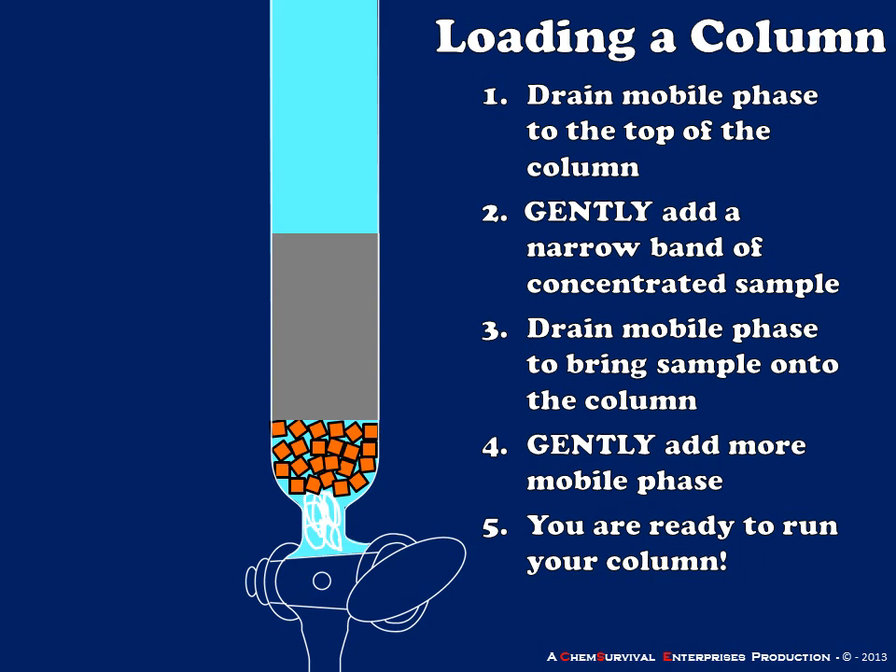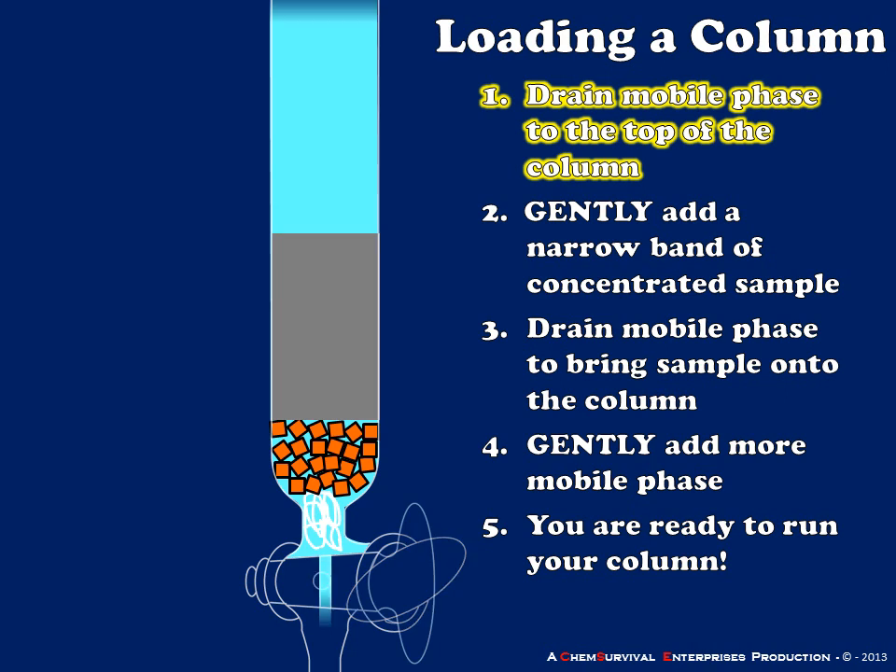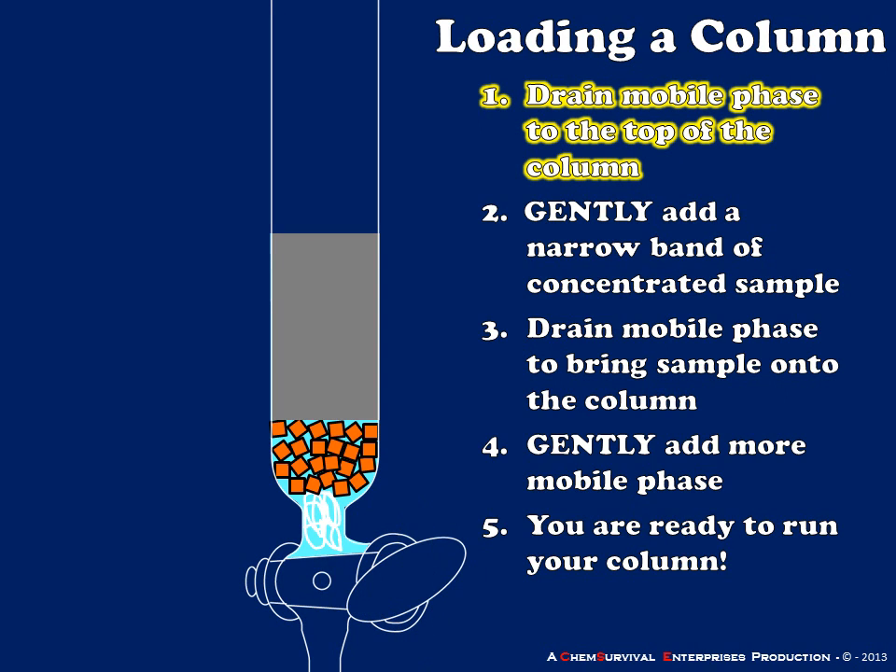Let's go ahead and load a column. First, let's review each component: I have my glass wool plug to prevent any solids from flowing through the stopcock when opened. My sand layer gets me above the taper and provides a level surface onto which my silica column can be packed. My silica gel column is of uniform width, density, and length, and above this I have my mobile phase saturating the entire system. To load the column, I'll drain my mobile phase to the top of the stationary phase, stopping just as it reaches that point — if I drain additional mobile phase out, my stationary phase can dry and that can cause problems.